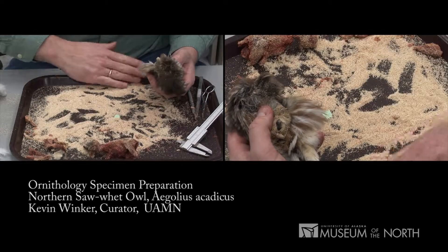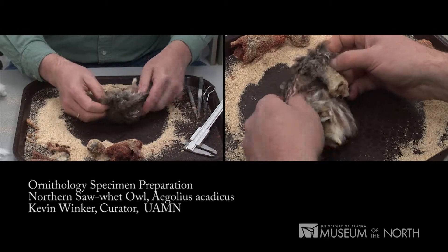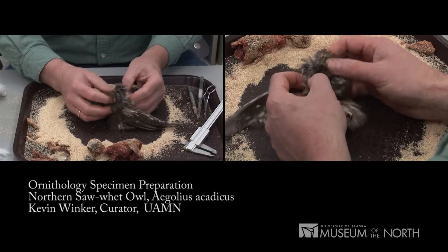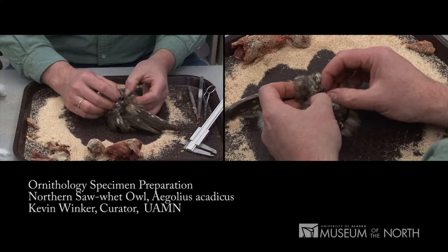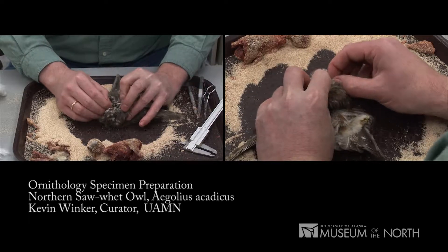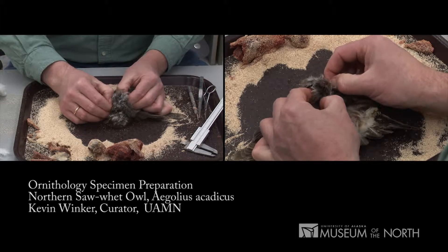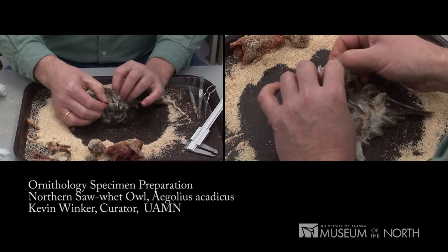Now that I'm turning the bird inside right, I want to get that corn cob dust — that absorbent — out of my way so that it doesn't get stuck up in the plumage. I might mention that corn cob dust: you can use sawdust, but in birds like owls the burrs from that dust will get caught up in the plumage very badly and it's hard to get it out. I'm turning the head inside right, getting so I can grab that bill and pull it free. Sometimes they're stubborn, but it'll come.